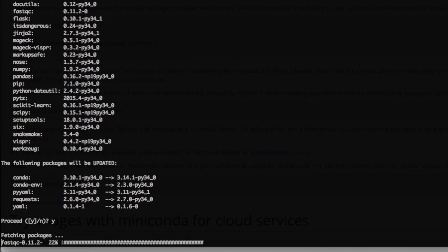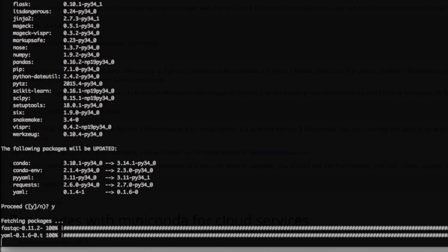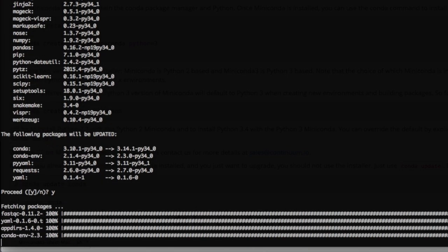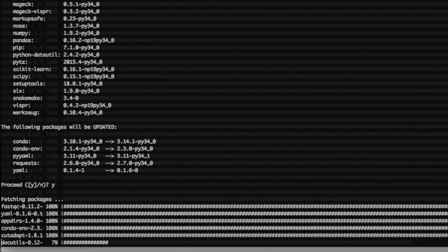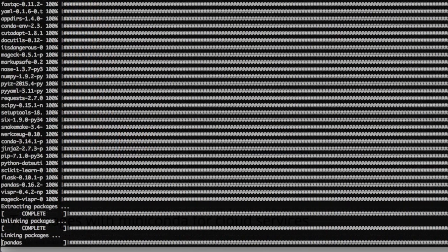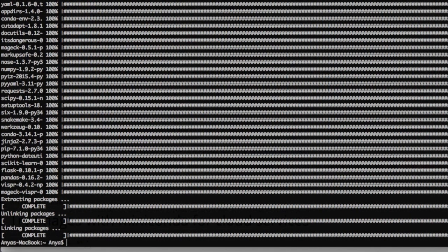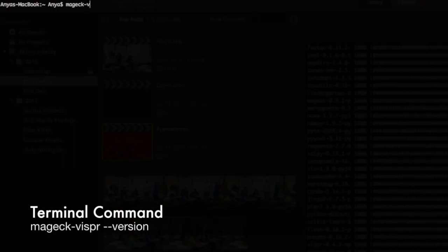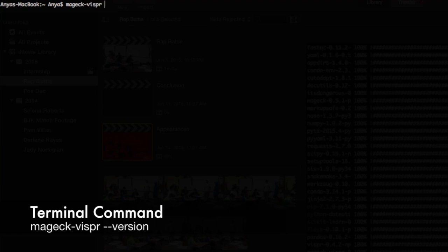Once again, you'll have to wait a few minutes for the packages to install. When installation is complete, you can test it once more by inputting mageck-vispr --version. Again, the output of a version number means the installation was successful.